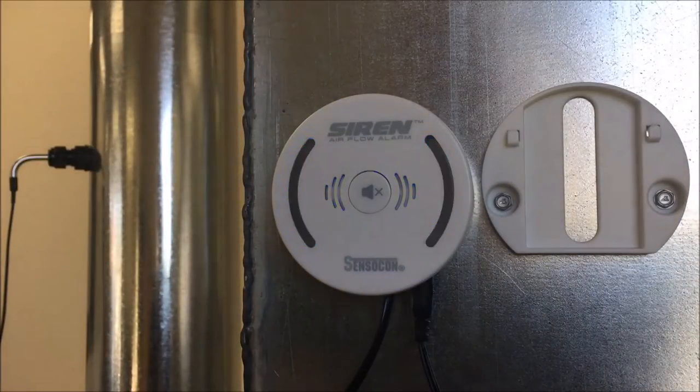On top of the siren you will find the calibration button. Once the operational velocity has been reached, press and hold the button for three seconds. The LED lights will flash purple indicating that the calibration is in progress.